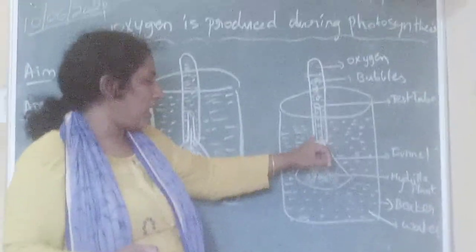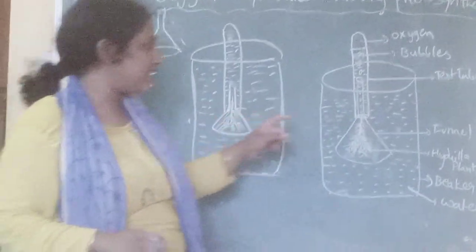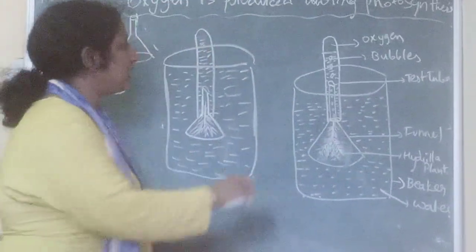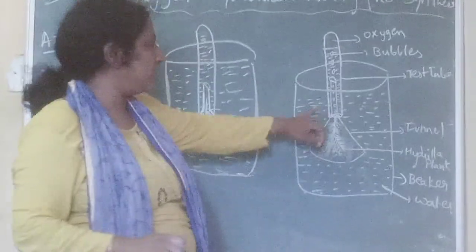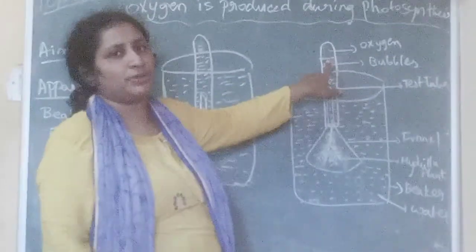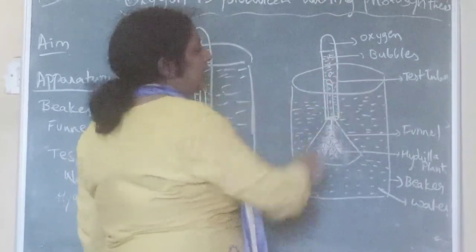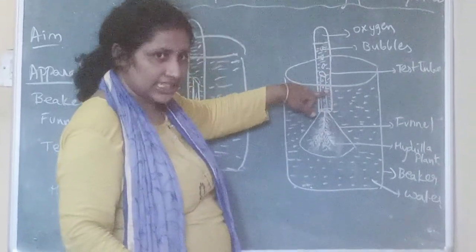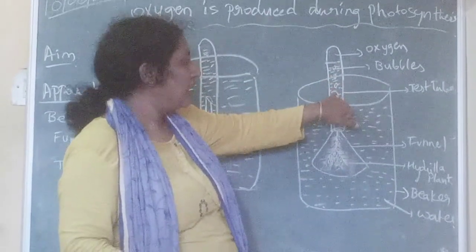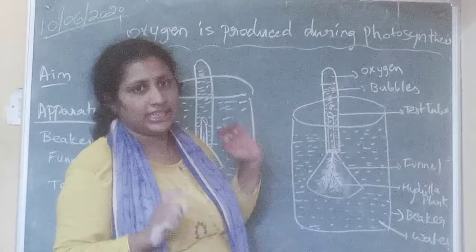On the stem of the funnel, insert one test tube containing water over the stem. The water in the test tube should be definitely above the tip of the funnel. If the water is not above the tip of the funnel, the setup will not work correctly.